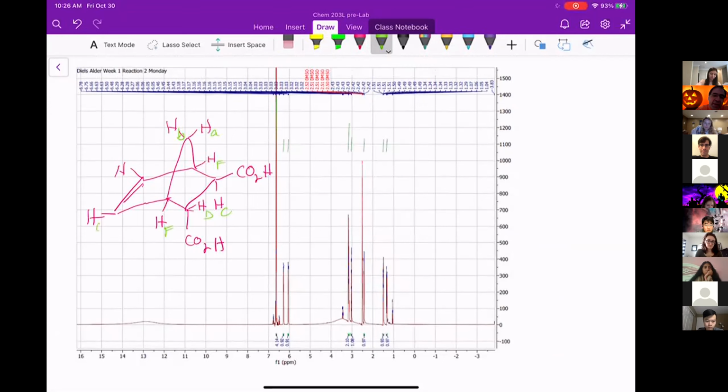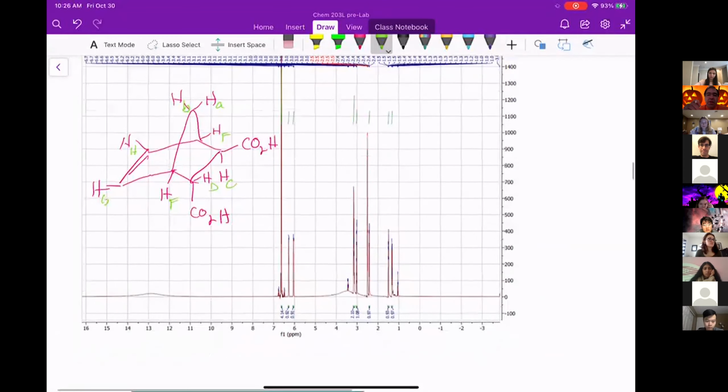Now, in this case, I'm going to go ahead and give this away, that these 2 protons on the left are separate again, because I've got an extra peak in here. So what happened? Not only are these 2 up here, which are referred to as geminal hydrogens, because they're Geminis, they're the twins, they're on the same carbon here. They're unequivalent. In this molecule, these 2 hydrogens end up being unequivalent. So we're trying to say, how does this 3-dimensional arrangement cause that? What's going on here to get us all of these differences?